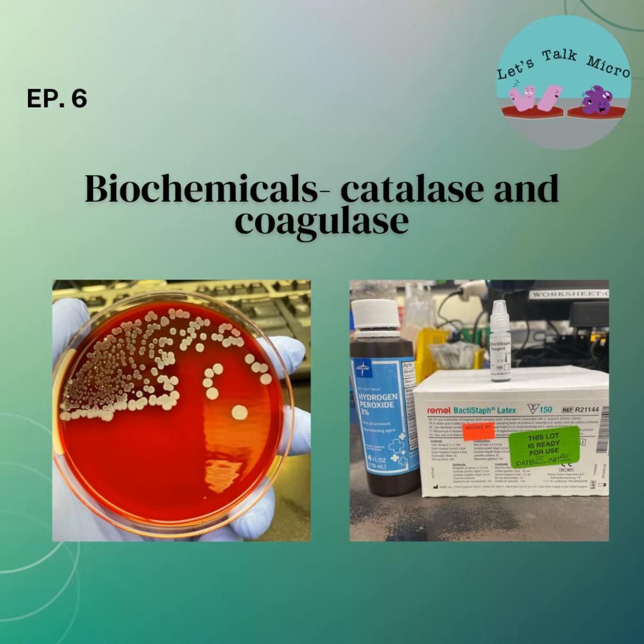So what is coagulase? Let's get technical. Coagulase is produced by Staph aureus and reacts with fibrinogen. This results in the precipitation of fibrinogen on the cell, which causes the cells to clump when a bacterial suspension is mixed with plasma.